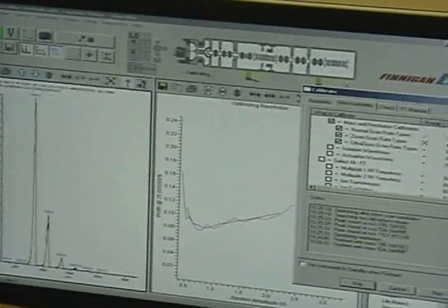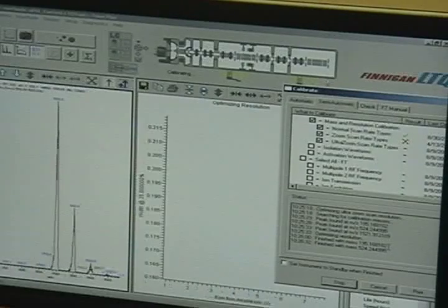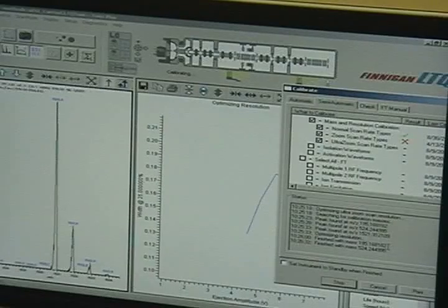With the FT, you get the resolution across a large range very quickly. If you would try to sample across here with ultra zoom, that would be slow.